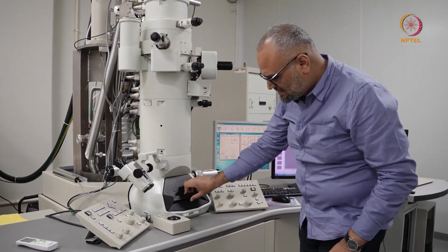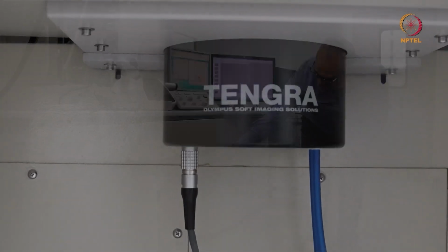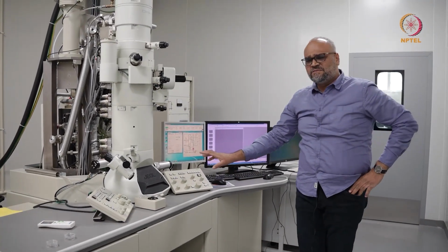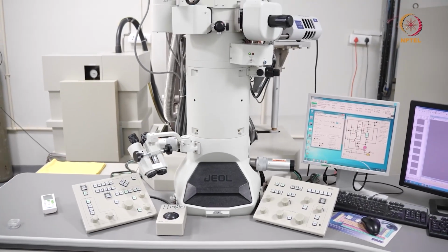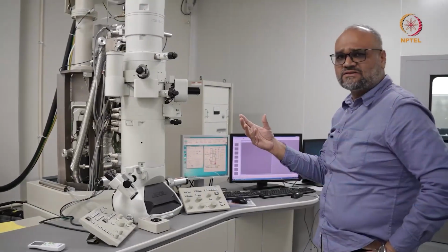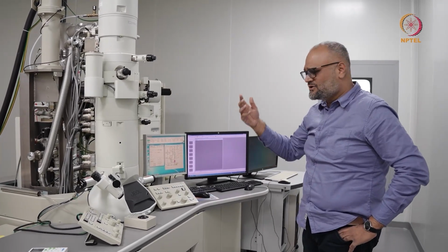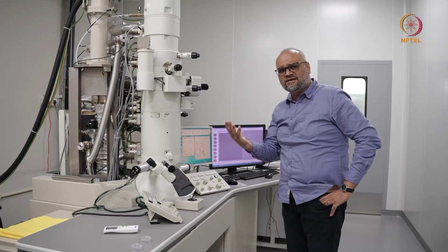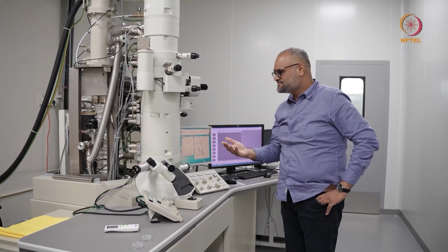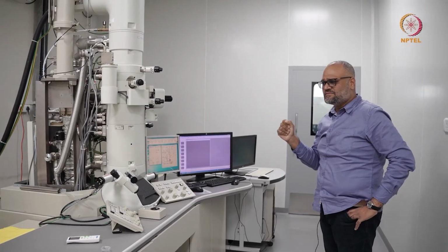And if you go further down, there's a camera below. On this microscope, we have a CCD camera on which you record the digital images. In the old school microscopes, you actually had photographic plates and you were exposing the electron beam and opening a shutter and recording the images on a photographic plate. So this is the general layout of a transmission electron microscope.